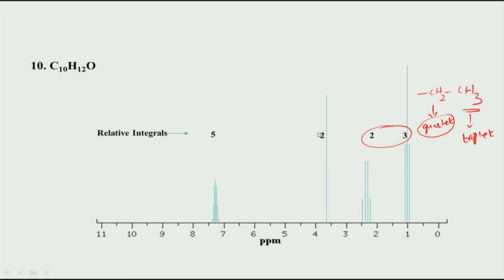You cannot expect a methyl group to have 2 peaks, and therefore, let us see how we can put it together. It basically is something like this. Here we can see that there is a single oxygen, and because there is no direct oxygen attached, this particular peak is not downfield shifted. So, this is what is shown here.